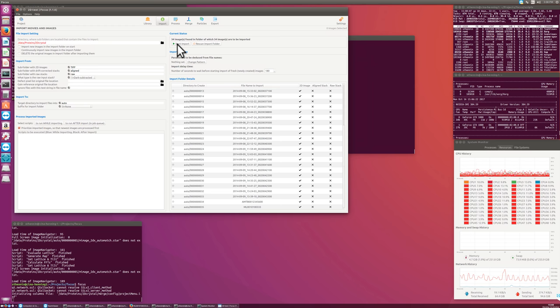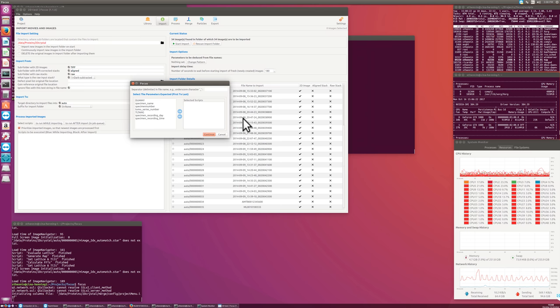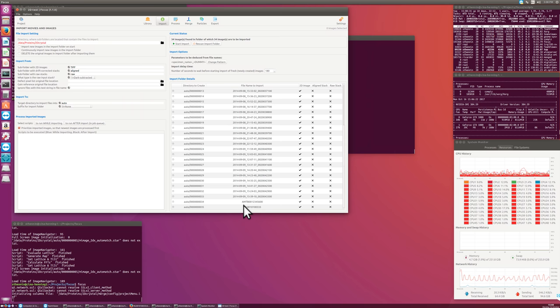And these file names here, they could contain information, but I'm not doing this now. So, well, maybe I do it. So the separation in the file name is an underscore, and my first field there is a specimen name, and everything else you can ignore. Just to see if we get this file name memorized somewhere.